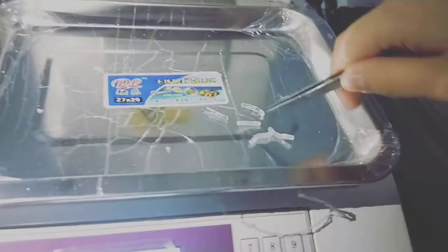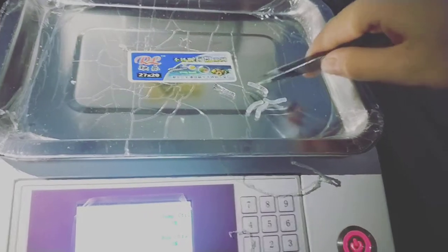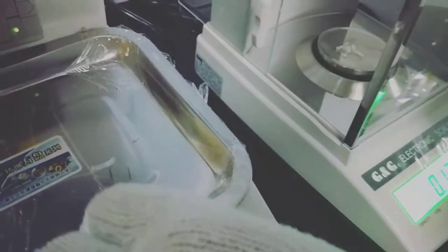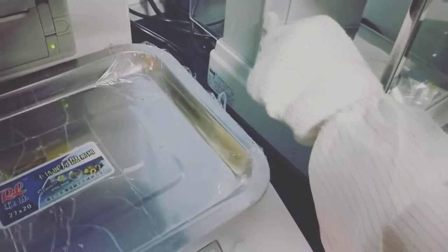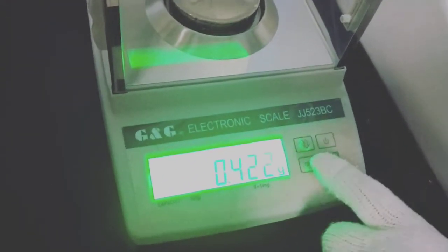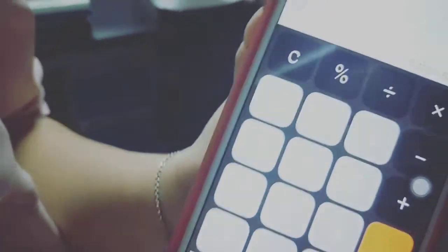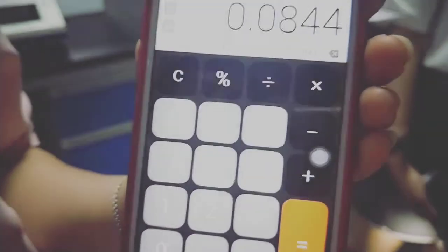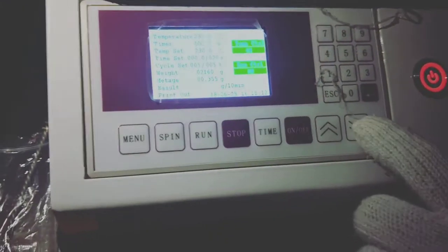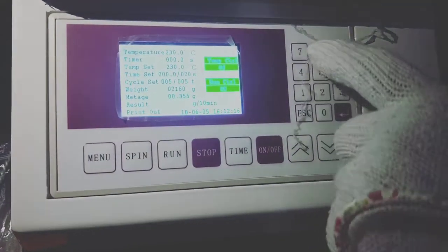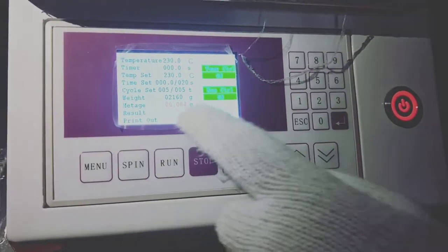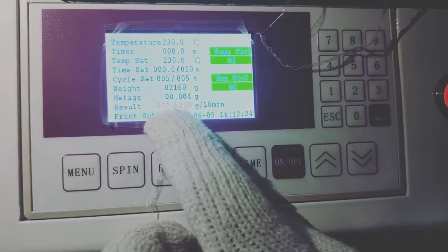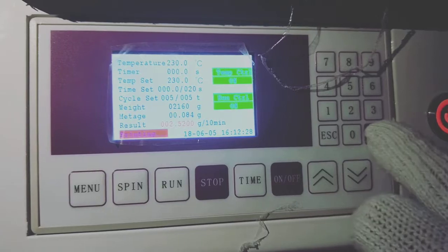Then we have already got five samples. We measured the five samples weight on the balance. We get those five samples weight is 0.422, so each piece is 0.0844. Then we input the sample average, 0.0844, then enter. Then we will get the results, 2.52 grams per 10 minutes, and print the result.